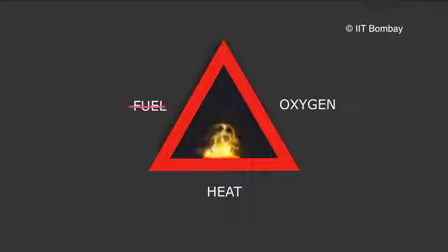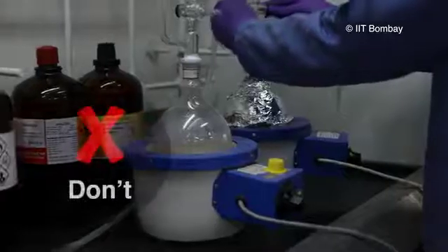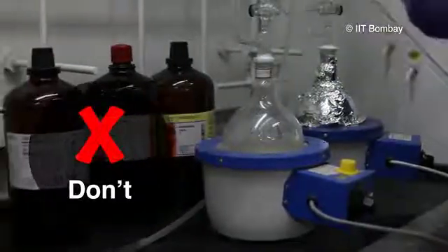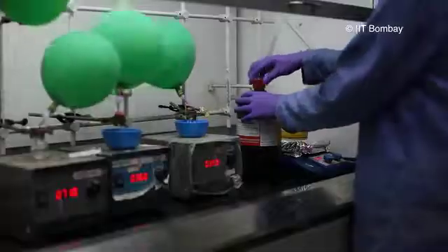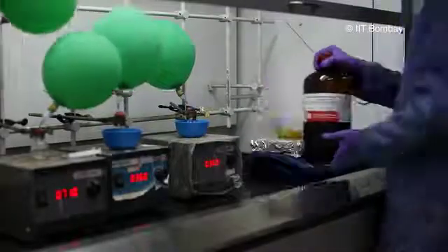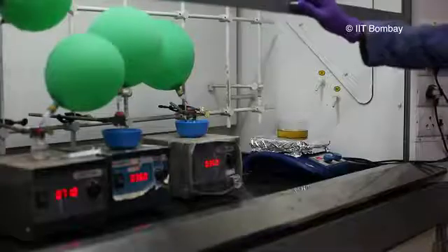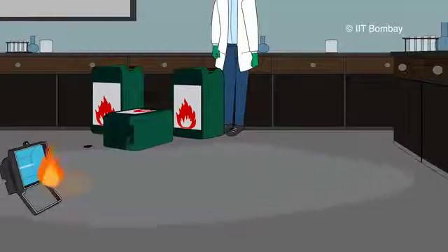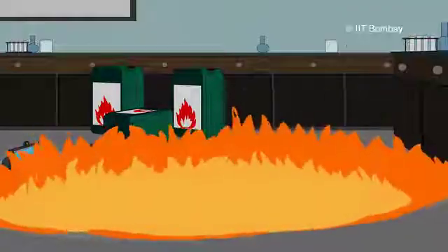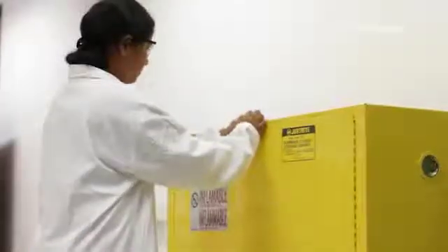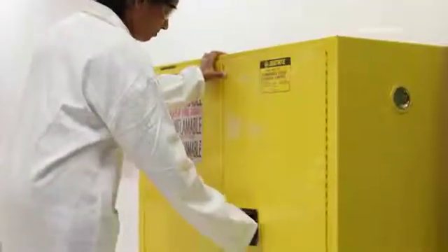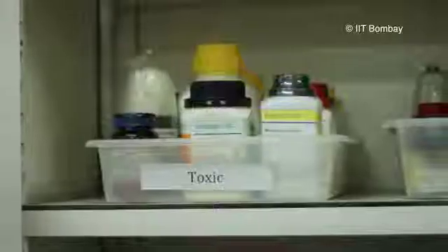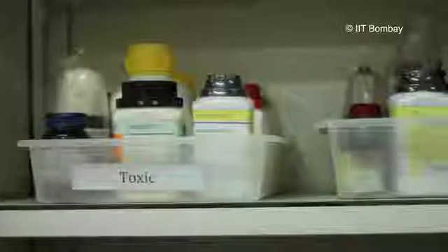We can prevent fires by ensuring that the elements of fire don't come together. Do not use fume hoods for storing flammable chemicals. Keep fume hoods clean. Keep flammable chemicals away from sources of ignition. Improper storage and handling of flammable solvents can cause a spill and a fire. Use safety cans and cabinets for storing flammable chemicals. Segregate chemicals on the basis of compatibility to prevent mixing of incompatible chemicals.